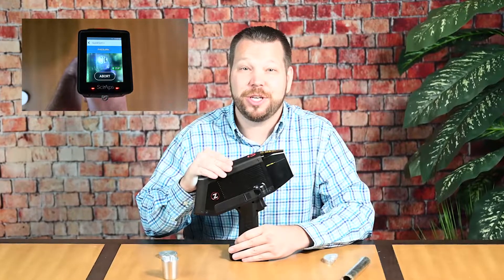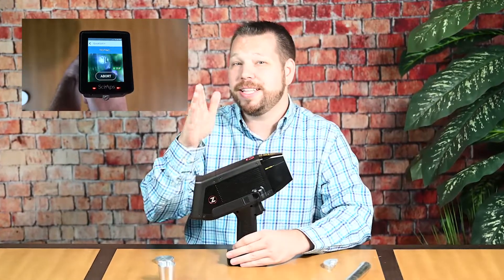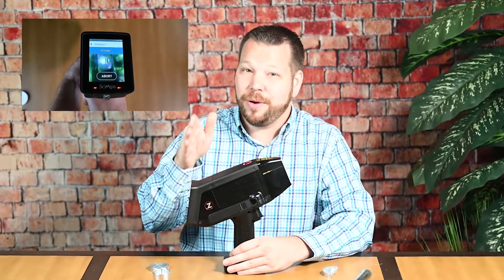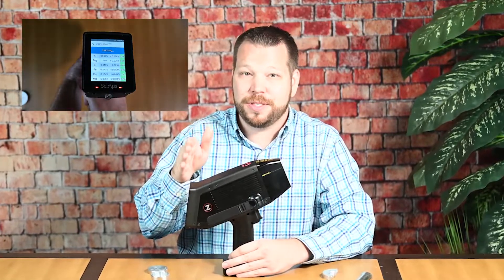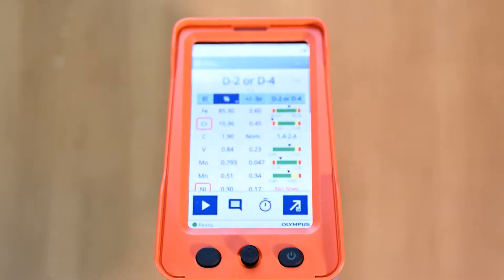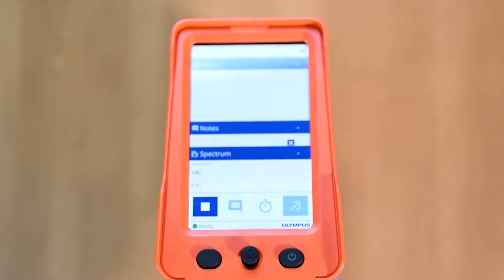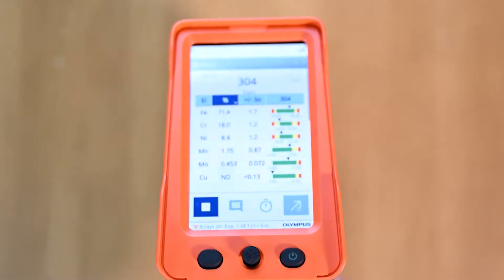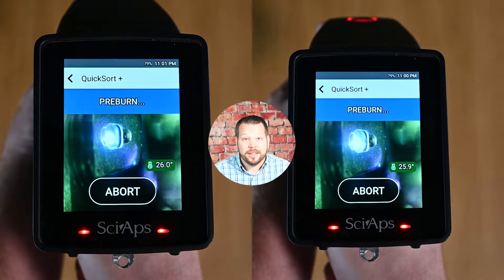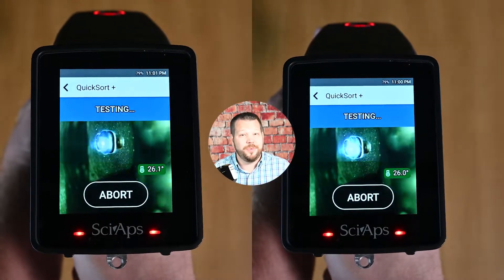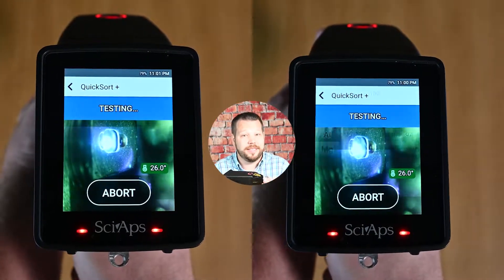Handheld LIBS technology is shown in this video, which can quickly and safely identify your aluminum alloys in only a few seconds. Handheld XRF can do a great job as well — just be sure that your handheld XRF is capable of measuring light elements such as magnesium and silicon. Now let's use our handheld to take a closer look at 6061 and 6063.